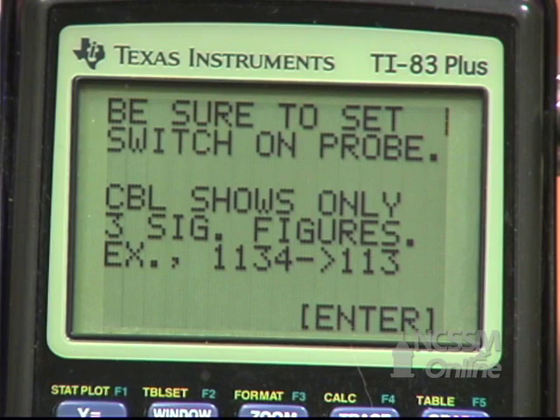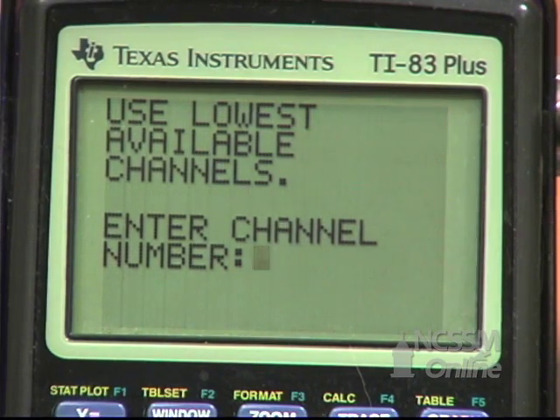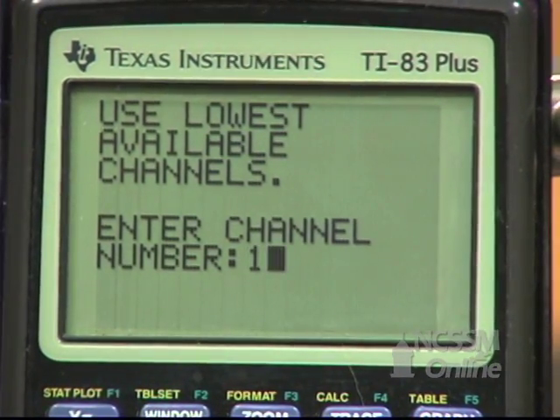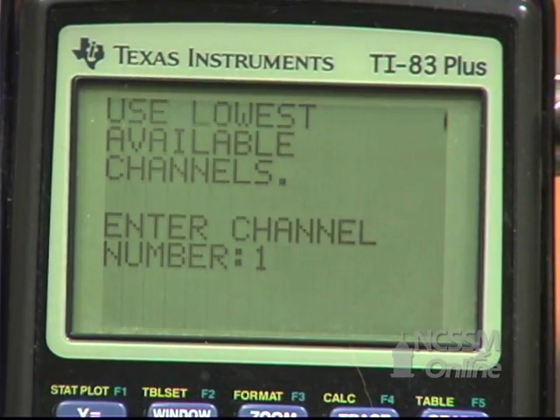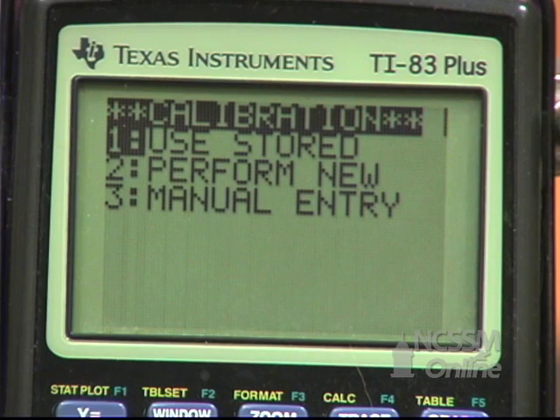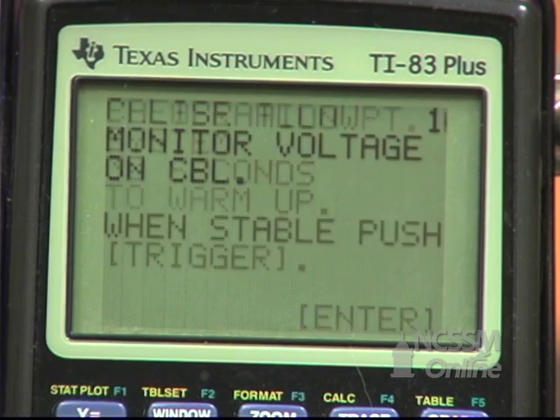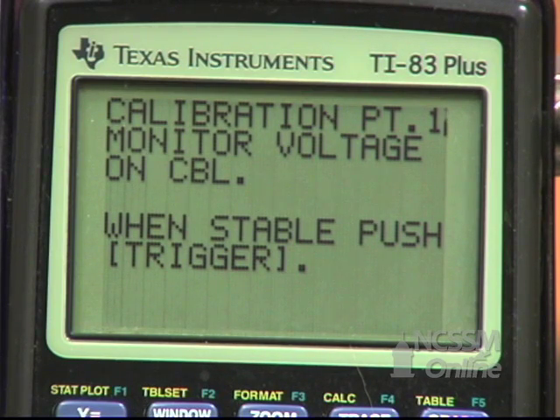We're going to set the switch on the CBL conductivity probe to 0 to 2000. It's in channel 1. We're going to perform a new calibration and wait 30 seconds for it to warm up, then press Enter. This is a two-point calibration.